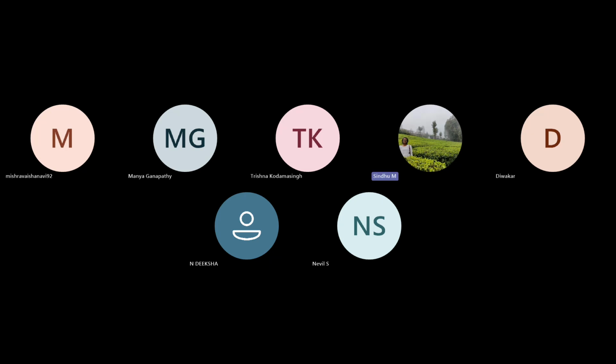So for this, we can use this demo image. Yeah. So this is the image at time point 1. And over time, you can see how these particles are moving and dividing and so on.